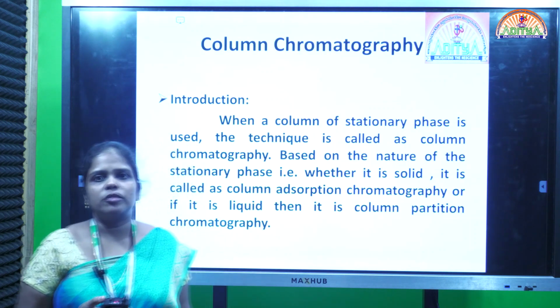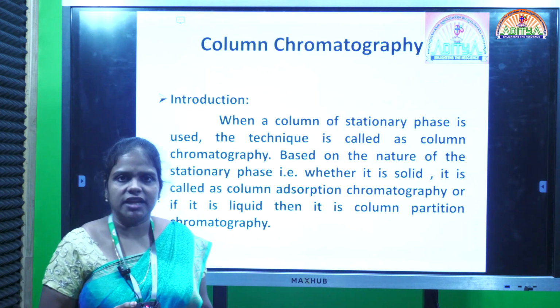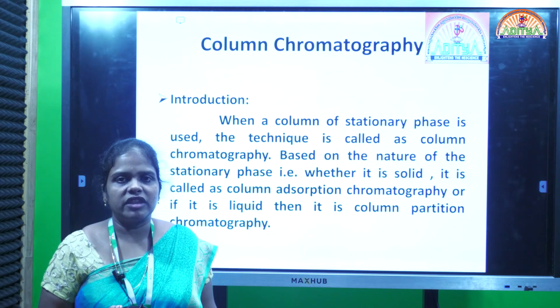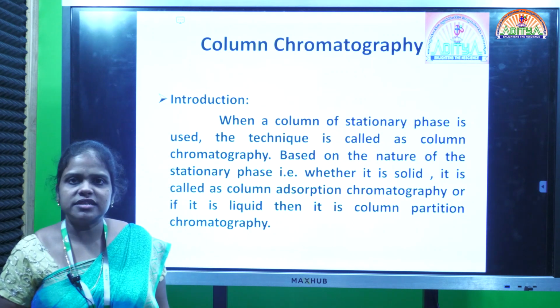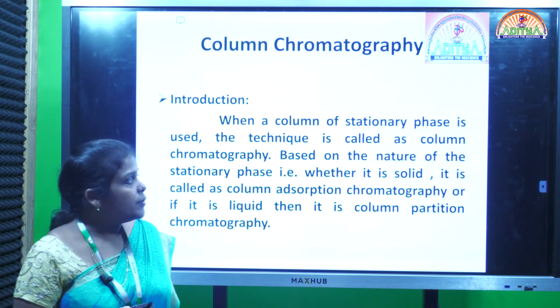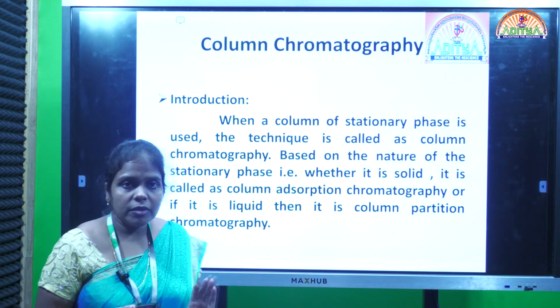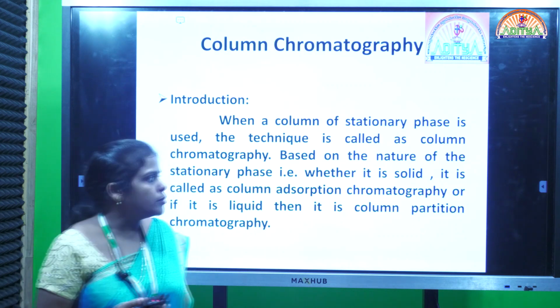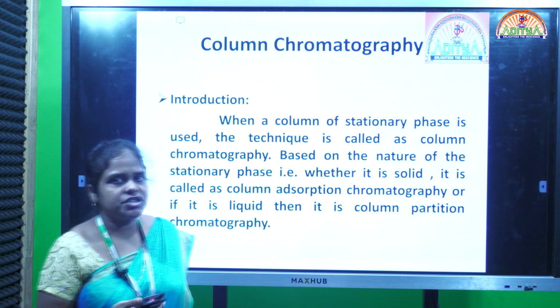So what is meant by column chromatography? It is also a chromatographic technique, but here we are using the column as a chromatographic bed. That's why its name came as column chromatography. And this column chromatography is also divided into two types: column adsorption chromatography and column partition chromatography.